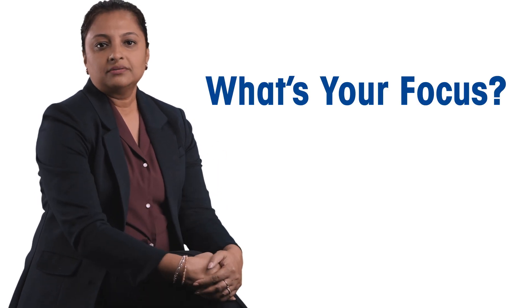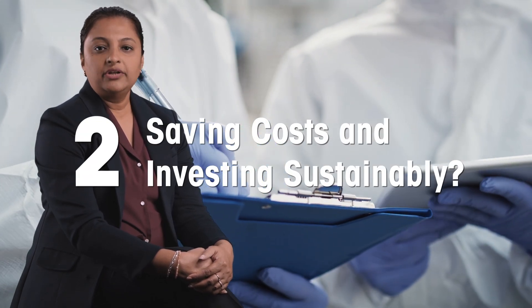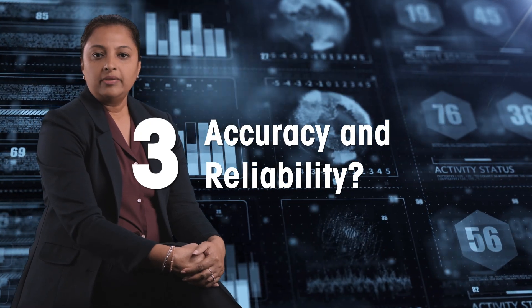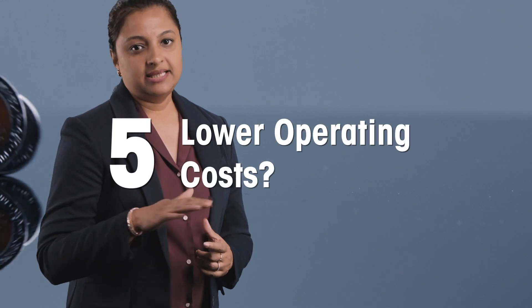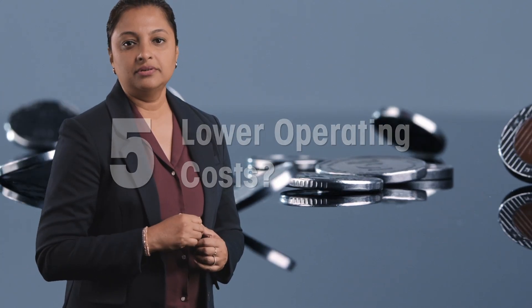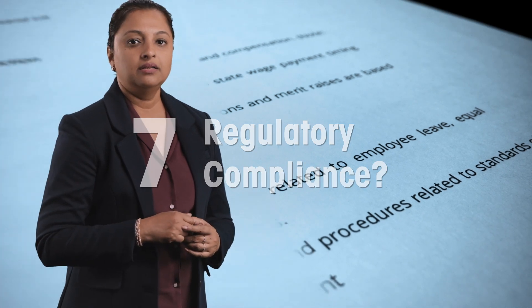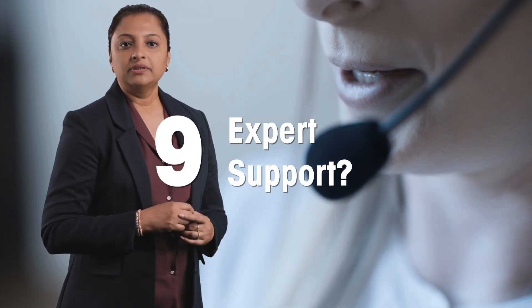When we developed our next pH measurement system, we asked ourselves a simple yet important question: What's your focus? Do you aim to enhance efficiency and boost lab productivity? Is your focus on reducing cost while investing sustainably? Is your priority flawless, repeatable routine analysis to ensure reliable, accurate and consistent results? Are you focused on integrating different lab equipment and software into a seamless system? Lower operation costs due to less downtime and maintenance? Prefer an intuitive interface to save time and avoid errors? Is regulatory adherence critical? Concerned about safeguarding your investment for future growth? Need always reliable expert assistance for troubleshooting?